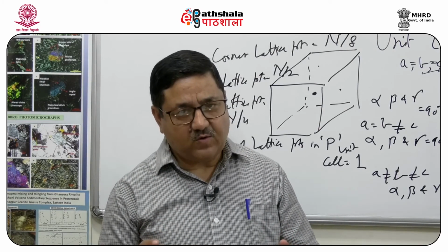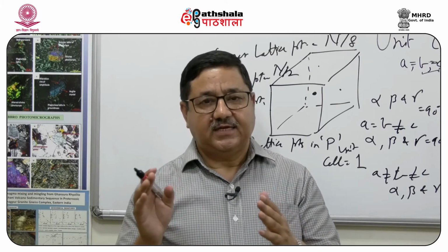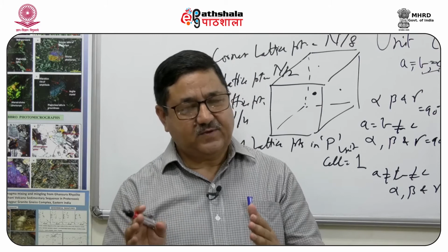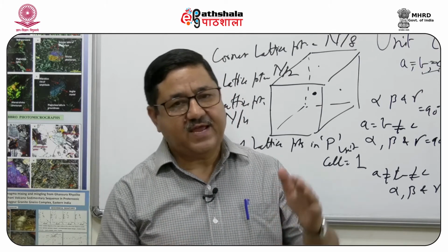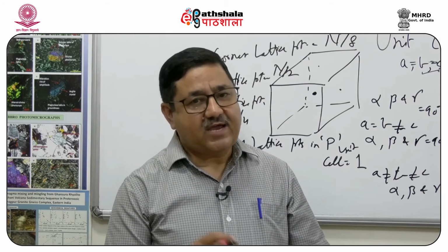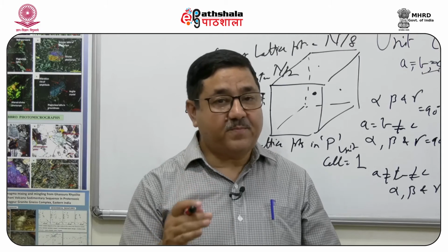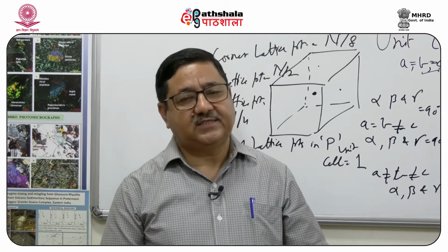So, with this background of the definition of the crystal, the unit cell which can be primitive or non-primitive, and the crystal systems, we try to investigate or understand the property which we are determining through X-ray diffraction.